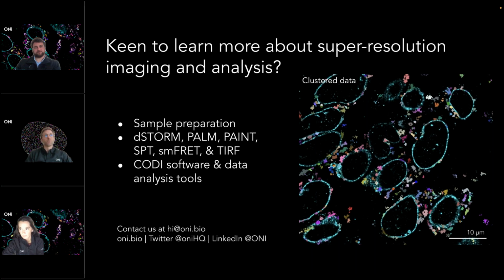But there's also all sorts of other methods. There's Ripley analysis, there's tessellation, there's all these sorts of analyses that you can do to compare clusters in 2 different channels and see if they're spatially close together or not. Another one is SODA, which is really great for statistical analysis and understanding if 2 kinds of receptors or 2 kinds of proteins are co-organizing or not. So long answer short, there's a lot of different algorithms that you can use to do it. Some of them hopefully will be showing up here in CODI to help you shortly.